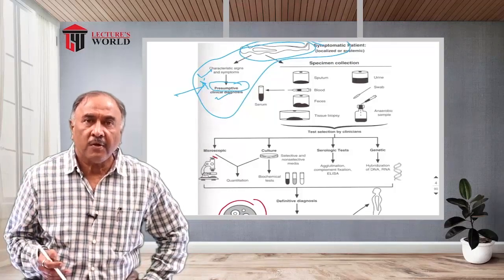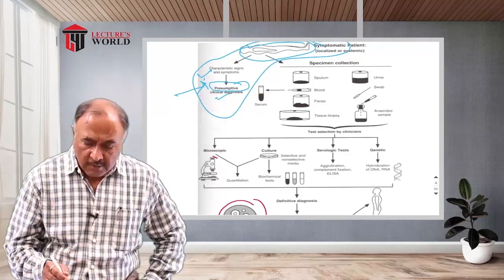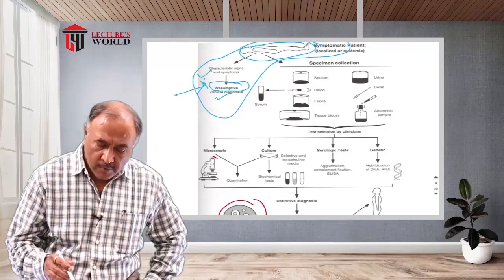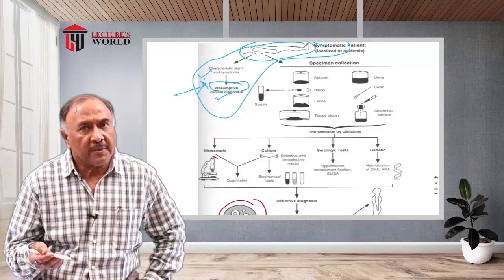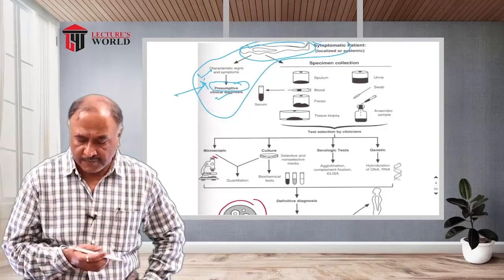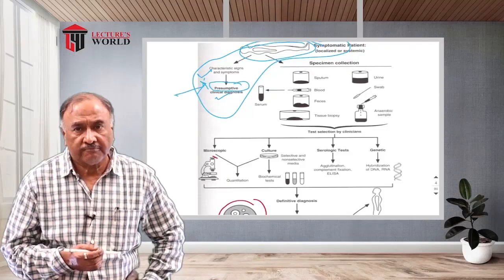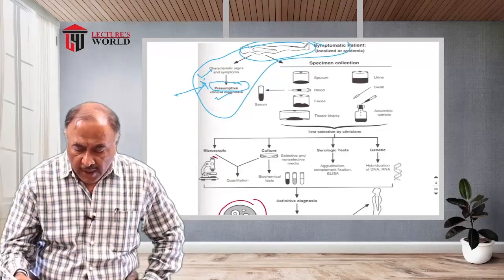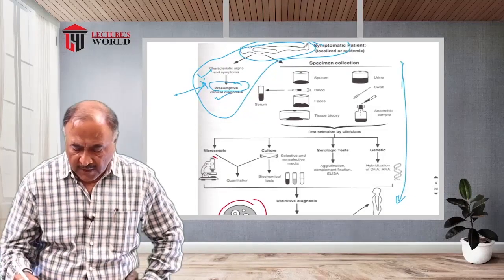And therefore, normally, the clinicians or routine doctors make a presumptive identification and treat the patient empirically. And normally the patient improves. But the right method is what we are now going to study here. These are the techniques.